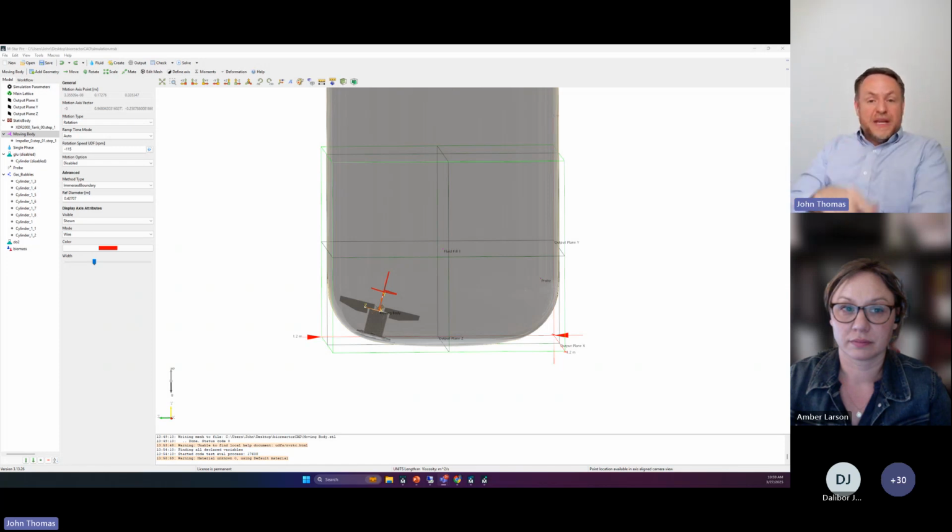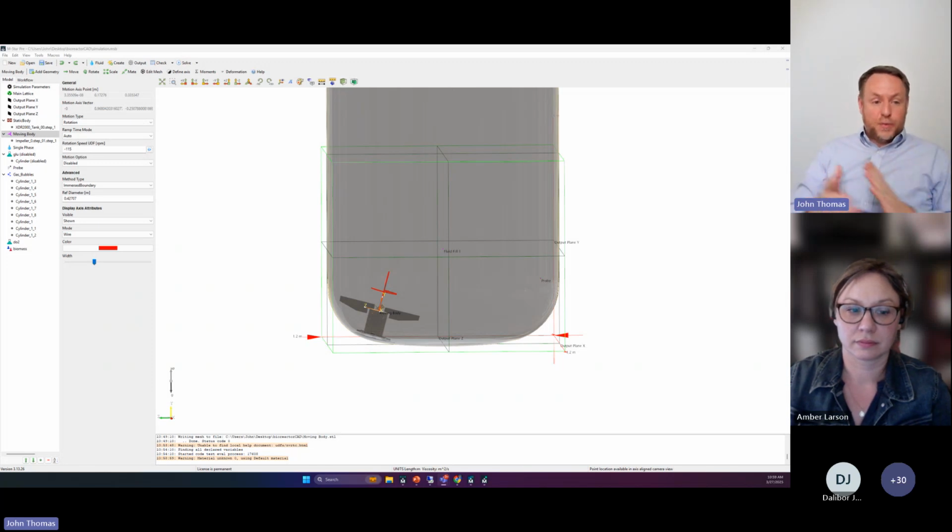You'd want your resolution to be at least a few dozen across that capillary gap in order to get the contact angle modeled correctly, as well as any velocity field should you need it. But microfluidics was one of the first applications of LBM, like flow through porous media. So yes, low Reynolds number creeping flows, contact angle driven flows, microchannel flows, that is bread and butter M-Star.